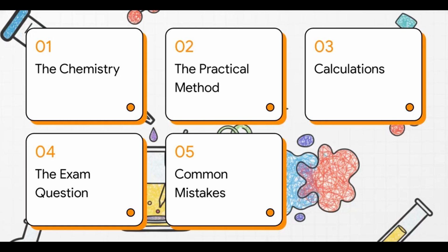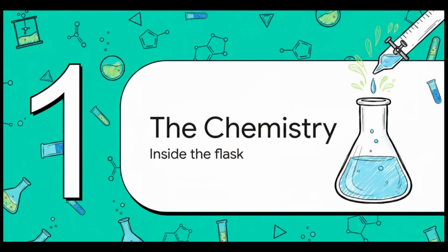So, here's our roadmap for today's explainer. 1. The chemistry. 2. The practical method. 3. Titration calculations. 4. The exam question. And 5. Common mistakes. Section 1. The chemistry. What is actually happening in the flask?